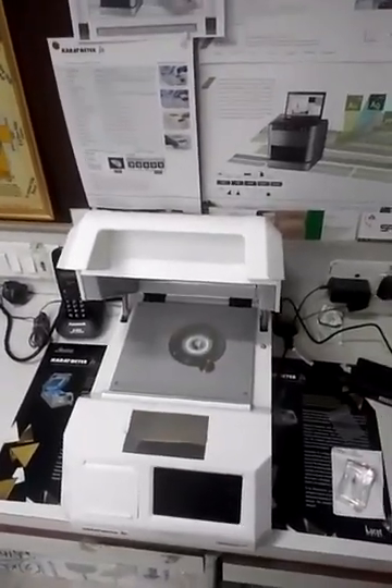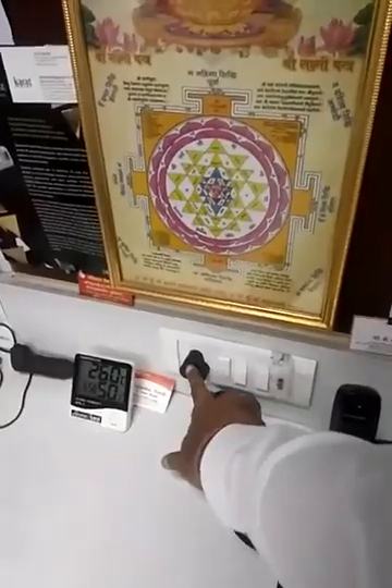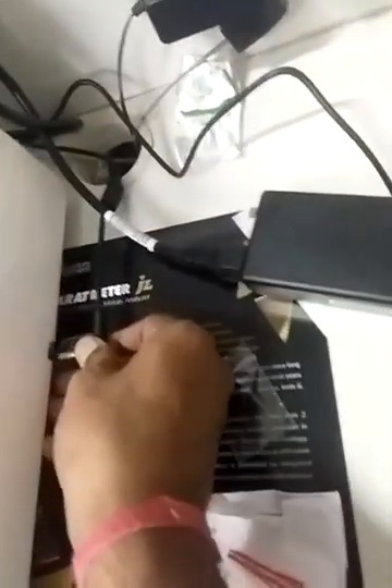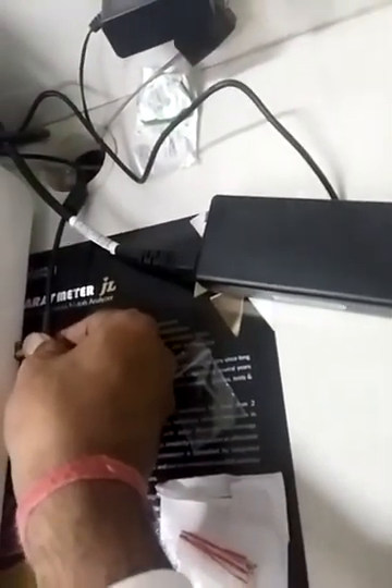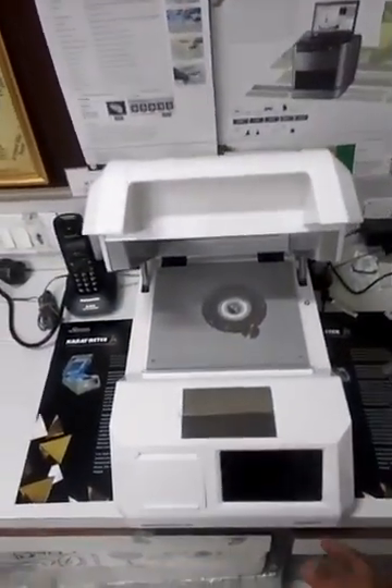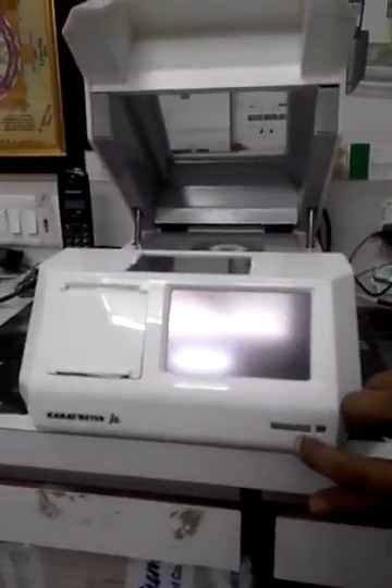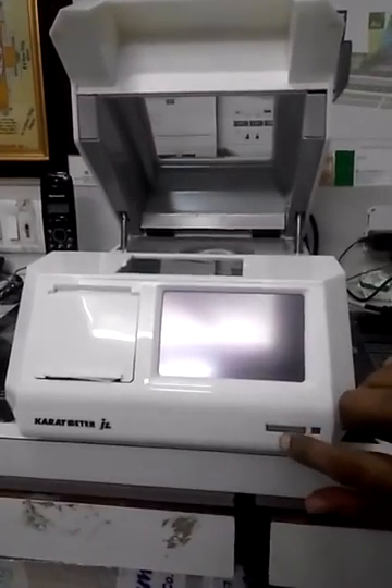This is a very simple plug-and-play unit. First, put one adapter on — you have to connect here properly. That's it, that is the installation. Now a single button click is there — you can see this Caratmeter JL. Click here.